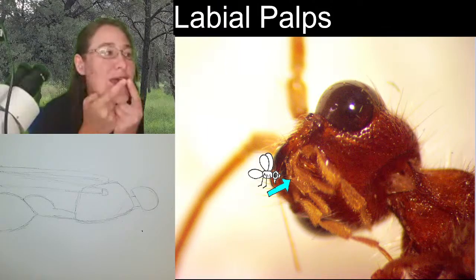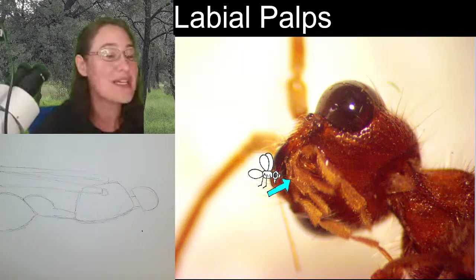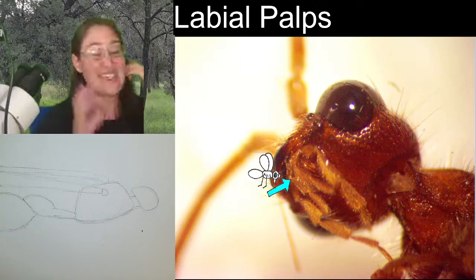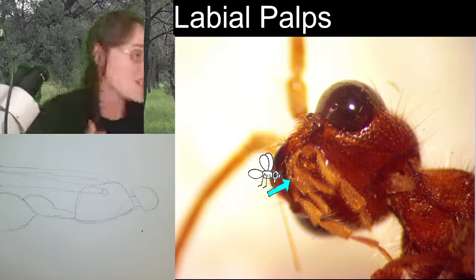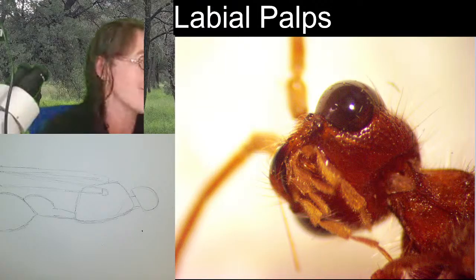And when they're all working at the same time, that helps our velvet ant significantly to eat and push all that food into its mouth. And I love that its palps are so giant. Okay, now we can go back to looking at it from a lateral point of view.